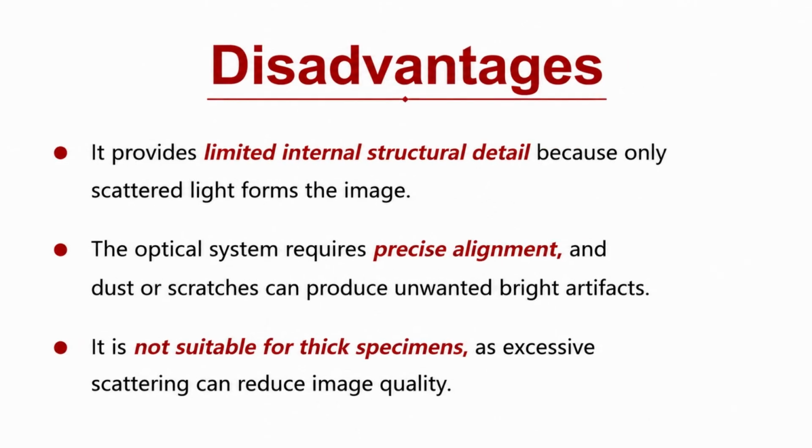Disadvantages: produces limited internal structural detail because the image is formed mainly by reflected and scattered light. Requires precise optical alignment, and dust or scratches can produce bright artifacts. Not suitable for thick specimens, as excessive scattering reduces image quality.